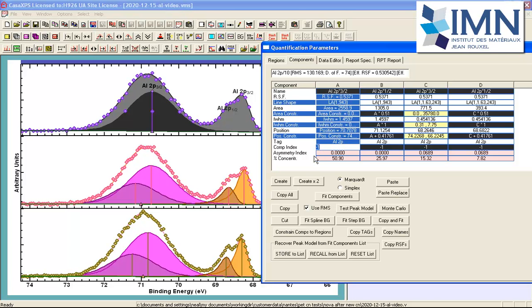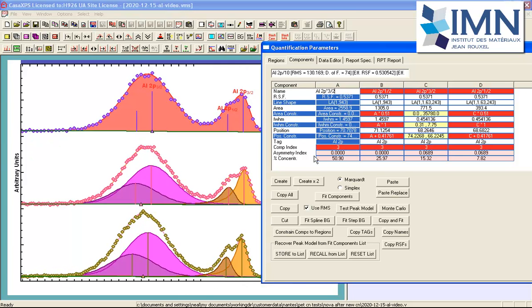We can also use a keyword that says set equals and then specify a value. So I've entered set equals and let's say 3. And what this will do is any component with the same component index, and these are all -1, will be assigned a new value of 3. So now we have all components with identical component index, and so we see a single envelope with a single fill color for all the components when they've all been summed.